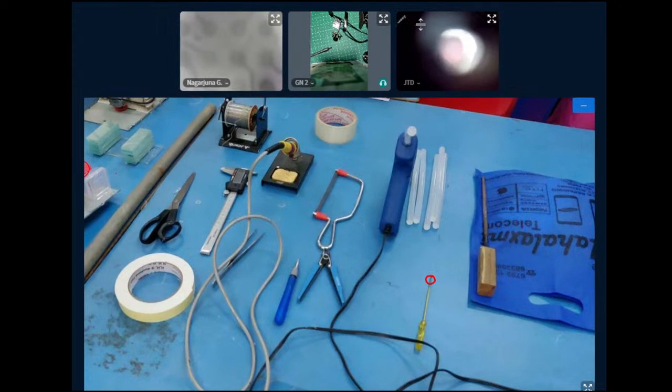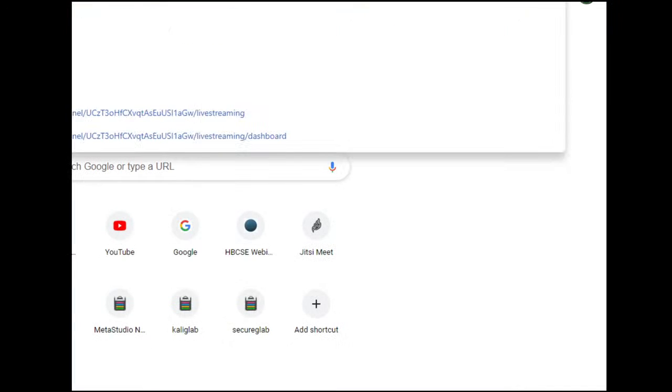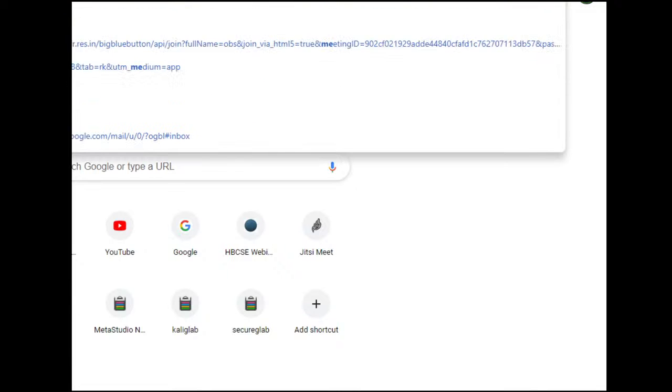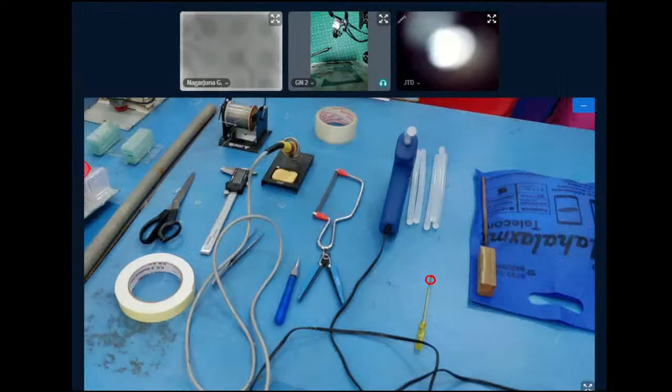Are there any who can get a webcam by next week? What are the things from which we can make a microscope? Yes, Green Apple is asking it. So we just need currently the webcam, any webcam that is working, that you can convert into a microscope. So you just need that, and a suitable screwdriver using which you can unpack and open it up.